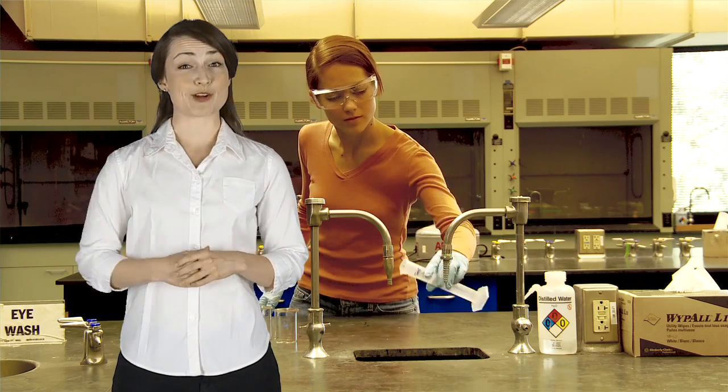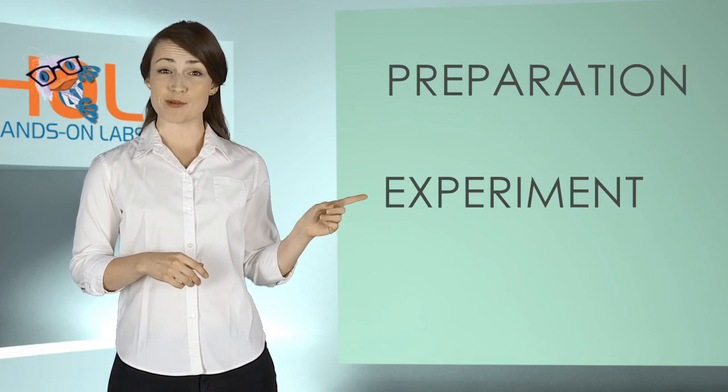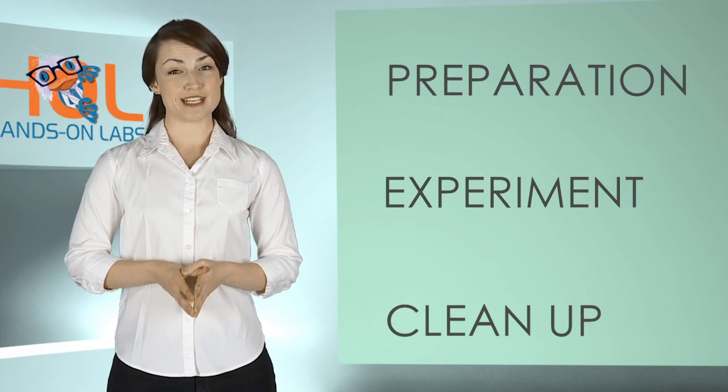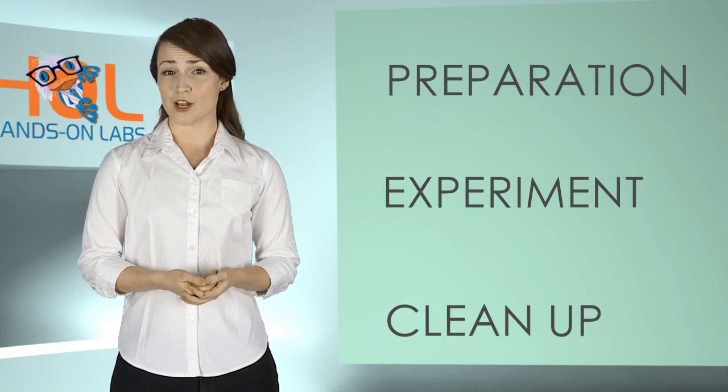Just like in a campus lab, there are three phases of laboratory safety measures for the at-home lab: preparation, experiment, and cleanup. Each phase has unique safety considerations. The concepts and procedures will differ somewhat working at home compared to a campus lab, but the objectives are always the same.